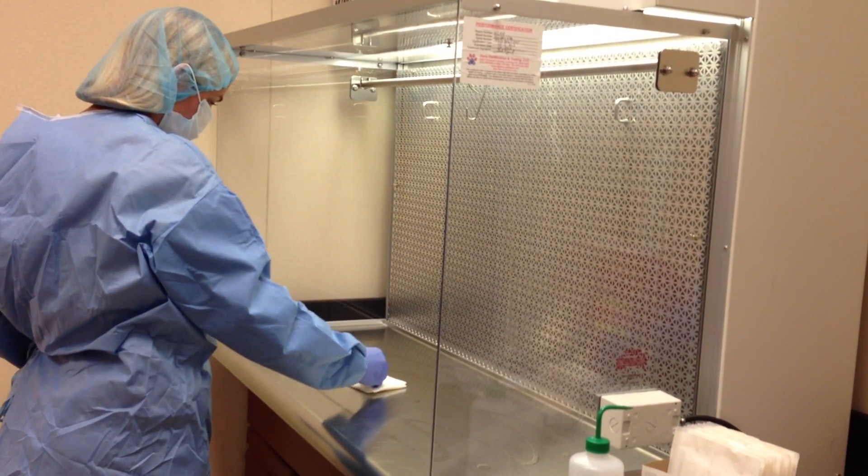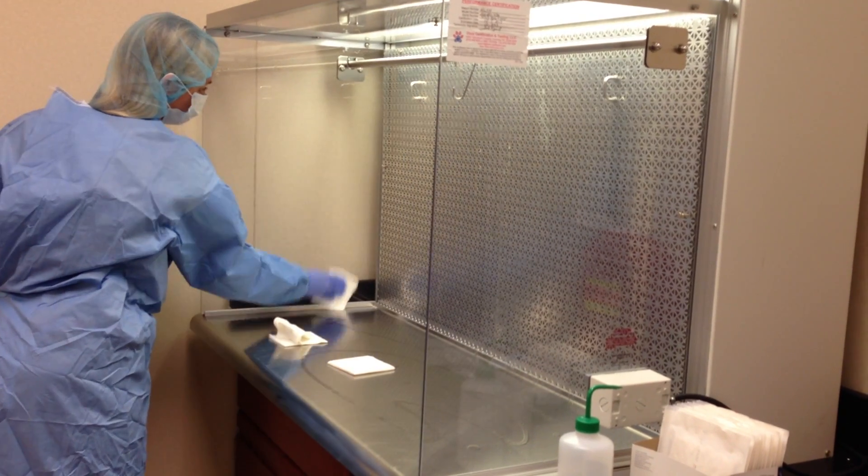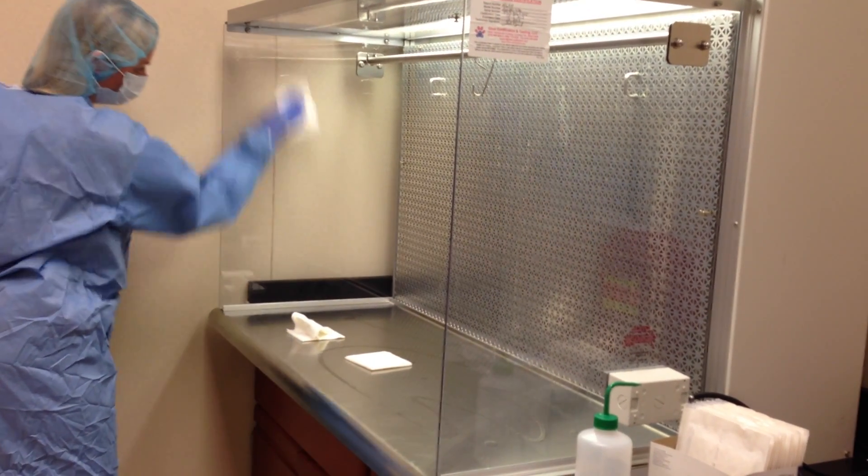Clean the sides of the hood, beginning at the top and working in a vertical downward motion back to front of the hood with overlapping strokes, using one gauze pad per side.